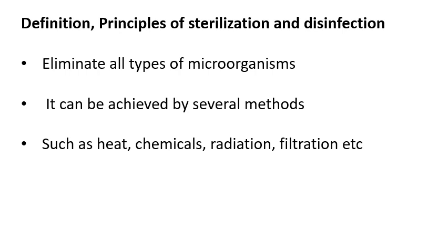We can use physical methods or chemical methods to sterilize the articles or objects. So on the whole, we can define sterilization as eliminating all types of microorganisms.